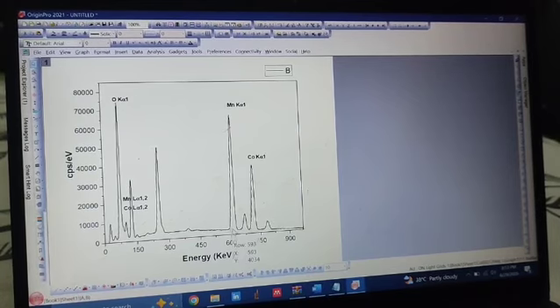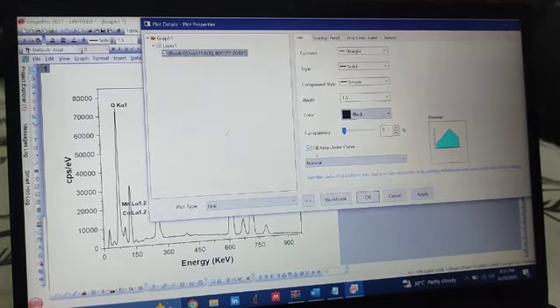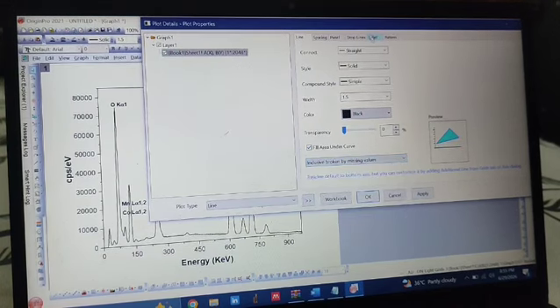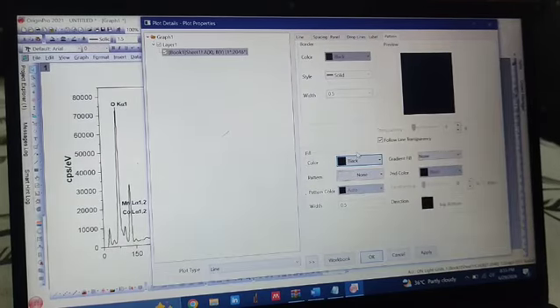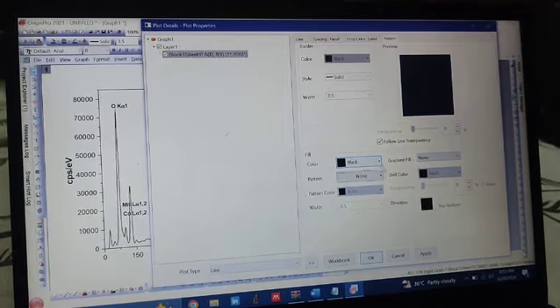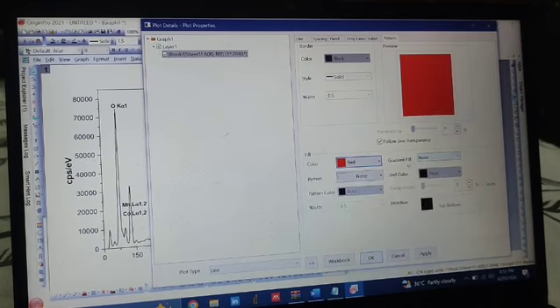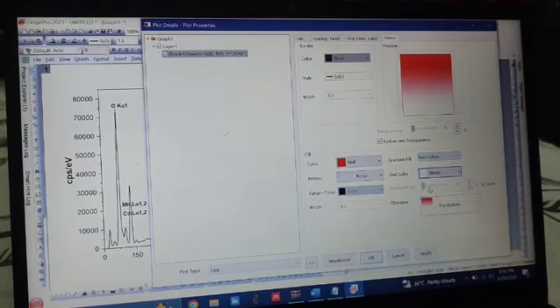Now, to make your graph visually appealing, double-click on the plotted line, then enable the fill area under the curve and select Inclusive Broken by Missing Values. Then go to the Pattern tab and choose a fill color. You can use a single color and choose the color which you want. Now, if you want to select gradient fill with two colors, then select two colors and adjust the color based on what looks best.